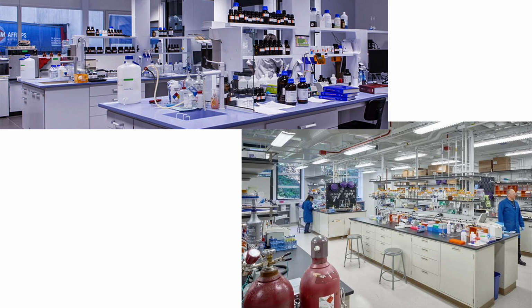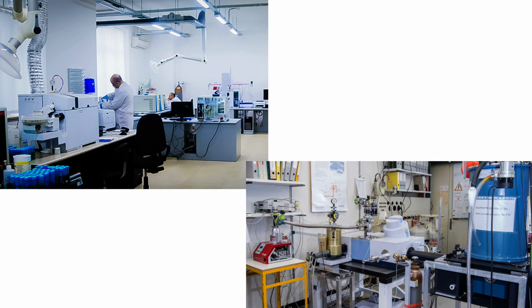So when you go into a chemical laboratory these days, it doesn't necessarily look like these pictures, a bunch of chemicals, benches where you mix things. This is a traditional chemistry lab. What you find instead is a bunch of instruments, a bunch of boxes. They're not black boxes anymore. They tend to be white, a bunch of white boxes. And these are different kinds of spectrometers. So a lot of modern chemistry labs, that's why we're showing you this, you're going to run into a lot of spectrometers that are used to make rapid measurements.